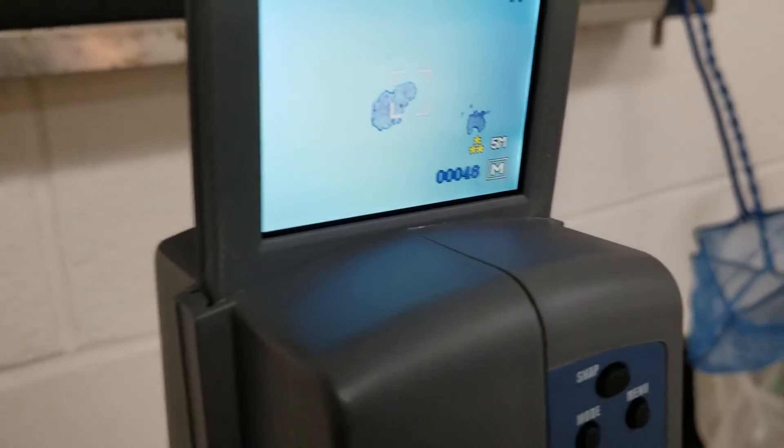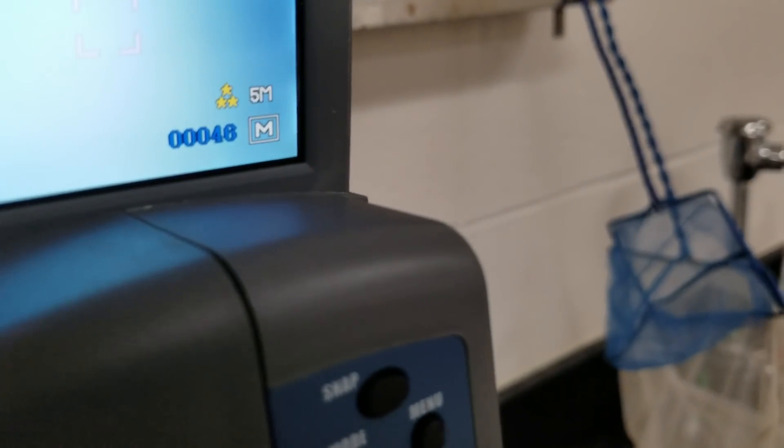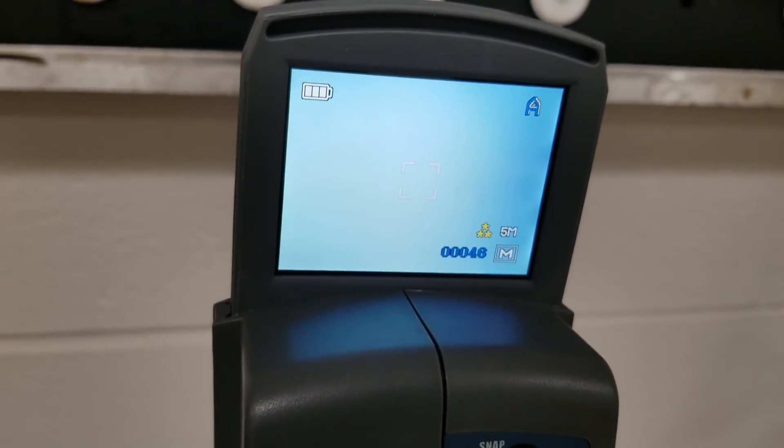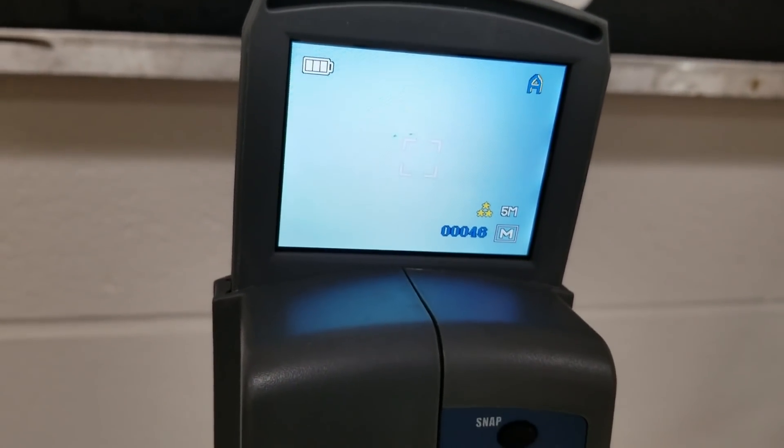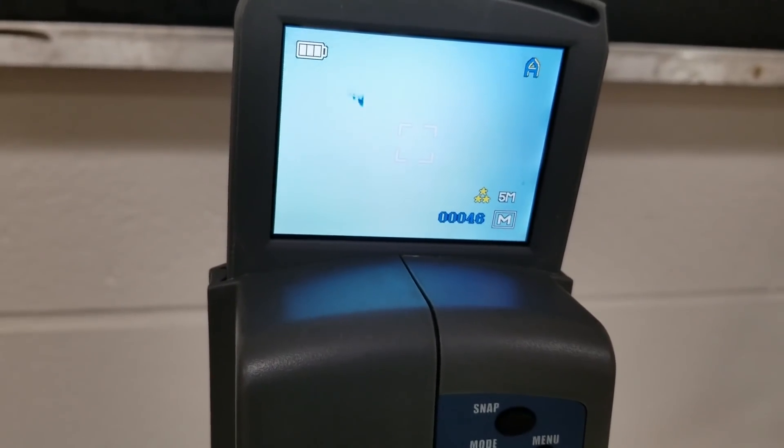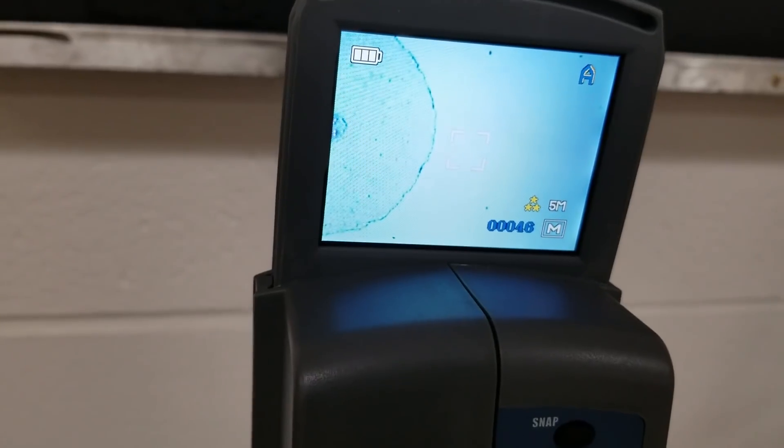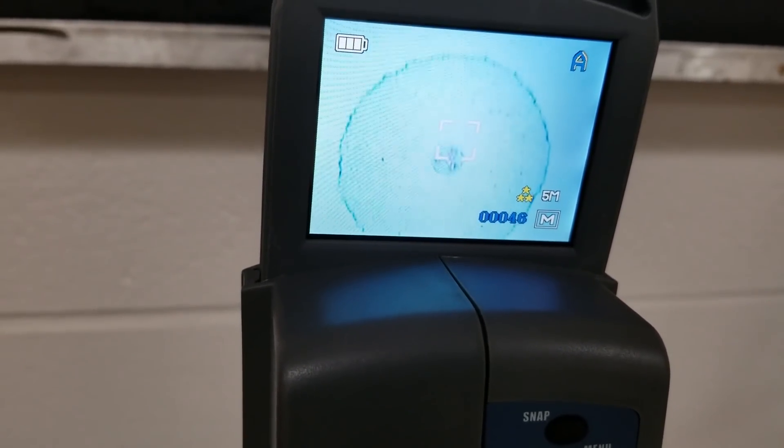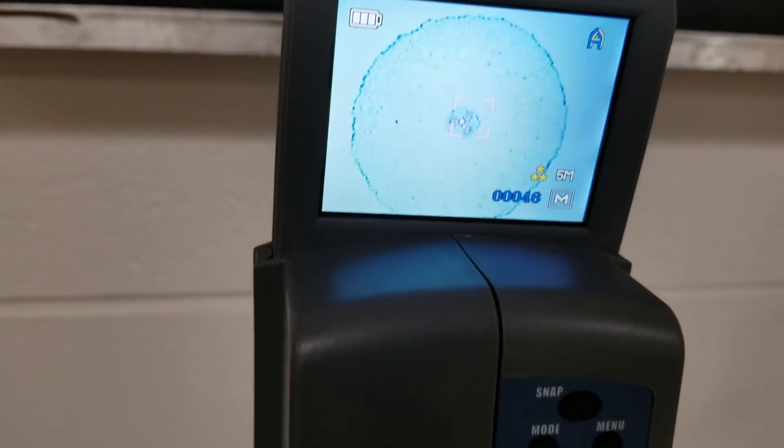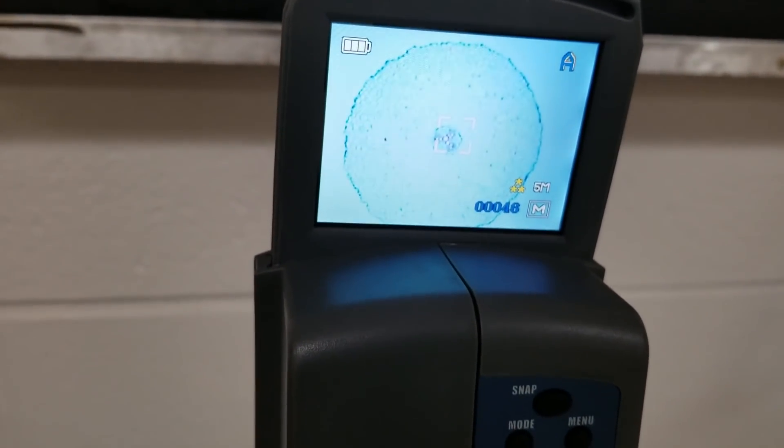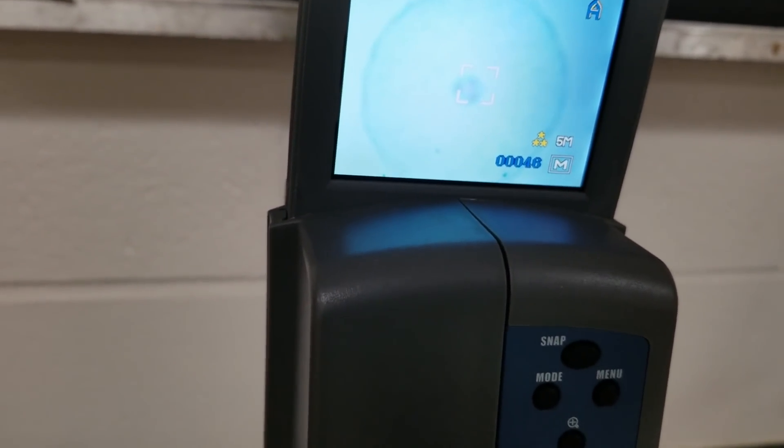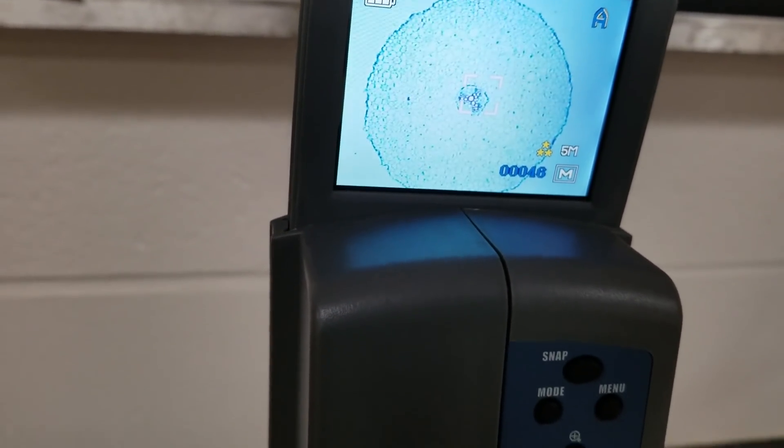So for our buttercup root, let's see if we can find this thing. There we go. We found what we're looking for. Here's our root slice. We can move the coarse adjustment knob until it becomes about as clear as possible.